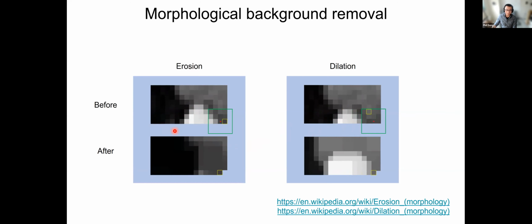So again, as you can imagine, the kernel size of this morphological operation is again a critical parameter for it to work. And in Minian, we use basically the same visualization to help you determine what's a proper kernel size for this step. Again, we have the image before and after the background removal plotted here. The corresponding contour is plotted in the middle.